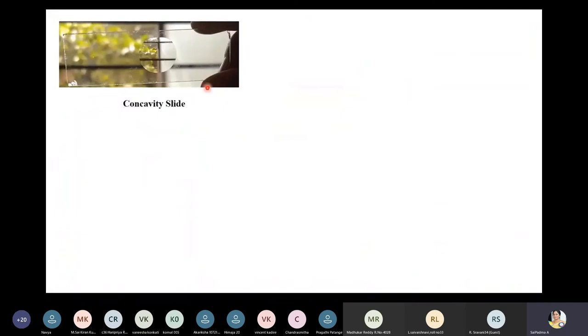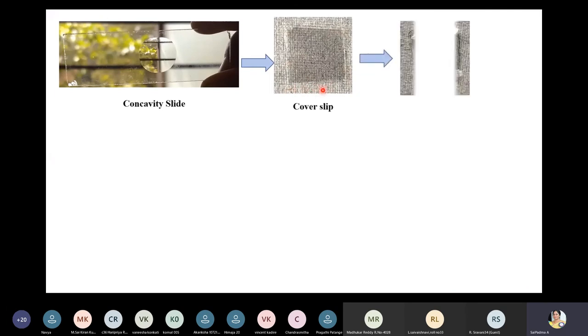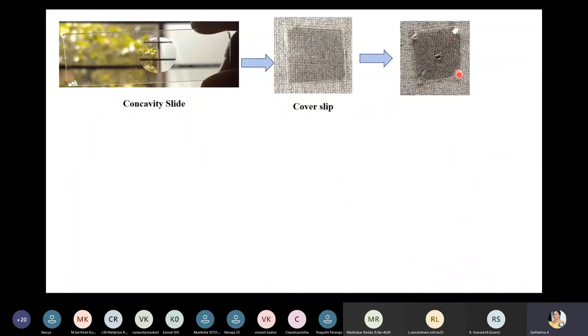This picture shows the first step: the concavity slide, also called the cavity or depression slide, with the depression visible in the center. The cover slip is a glass cover slip kept on a flat surface. At the four corners of the cover slip, a small amount of grease has been applied.